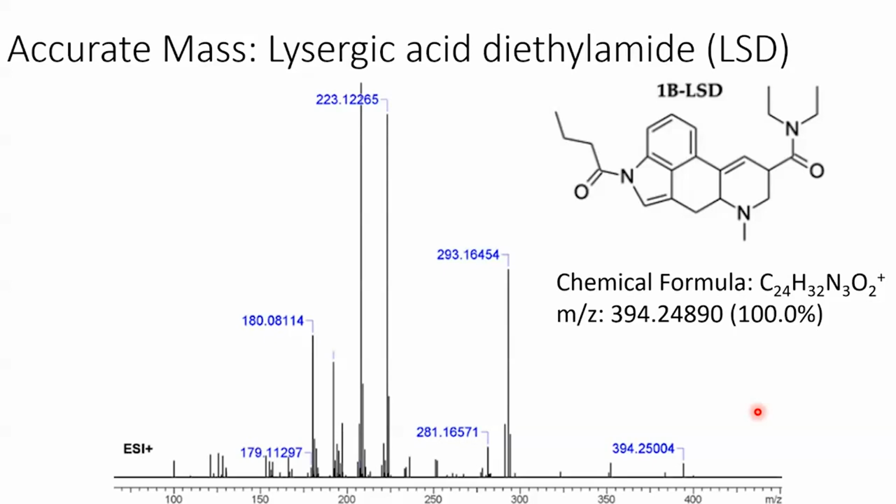And if it is matching to the standard within your degree of error, you're going to say, okay, that's fine, and then you'll run your unknown sample. But some degree of variation between these two numbers is acceptable in terms of still making a match to a specific chemical formula.